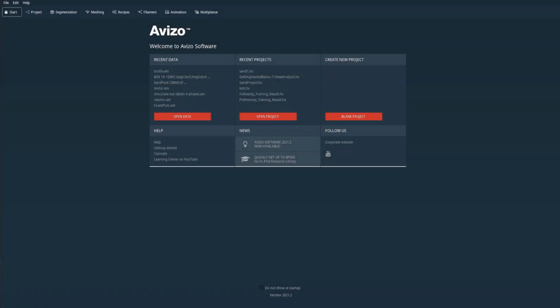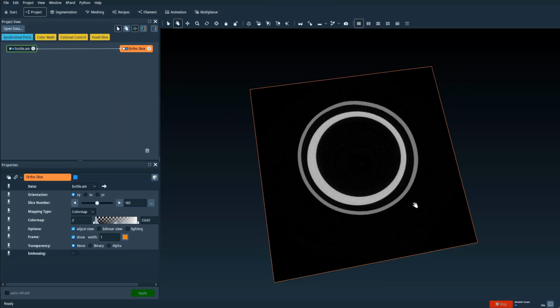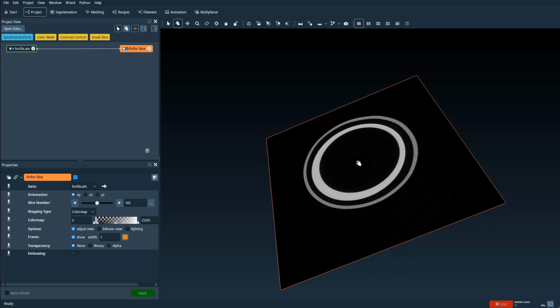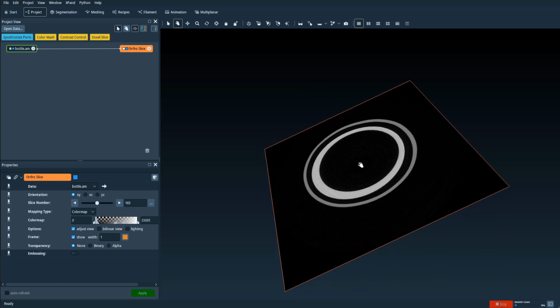The next thing I wanted to show is the segmentation tool called Watershed. And for this segmentation tool, I wanted to open up a new data set, which is a CT scan of a plastic bottle with cap. This data set is available from Thermo Fisher's tutorial that shows a similar example, so showing the Watershed algorithm to segment the data set. And I will provide the link to that tutorial in the workshop website if you're interested in having a look.